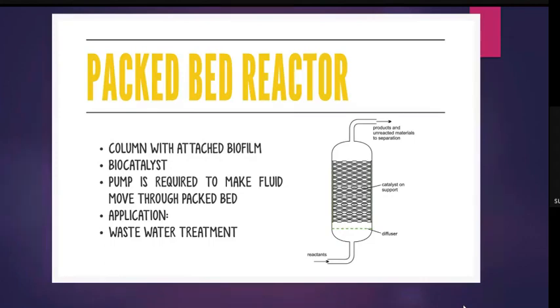Through that layer, if you are sending a sample through your beads, which are a polymer, right, either it will absorb some of the liquids, or the large molecular weight molecules or water molecules will bypass through the holes present in the polymer. Based upon that, the distribution happens and all the suspended particles will be attached to your polymer, and the reaction will happen through the solids.